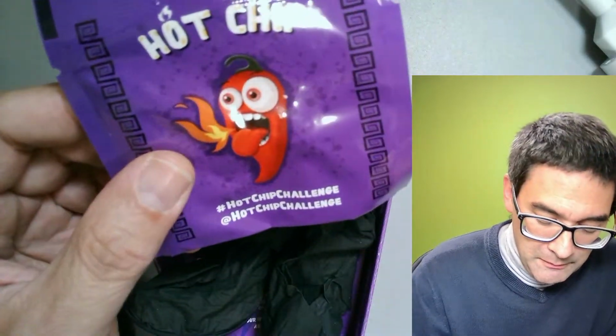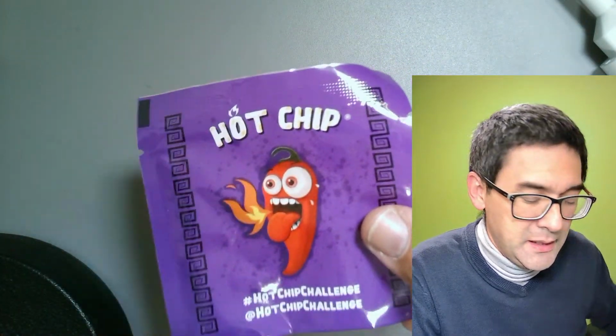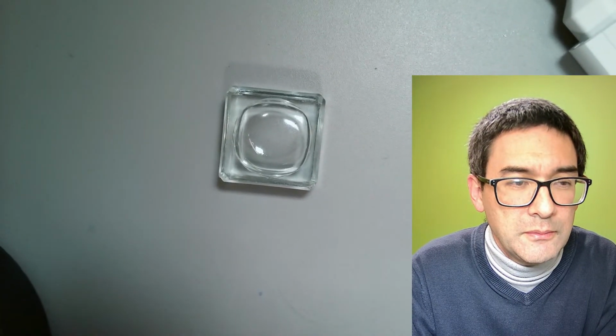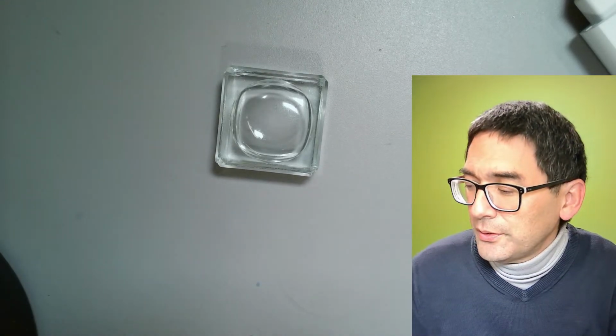And I want to take a small part of this and put it in this dish. Let me move this a little bit over, maybe, so that it's a little bit better. And I'm going to then put it under the microscope.